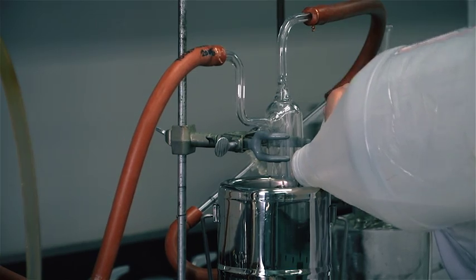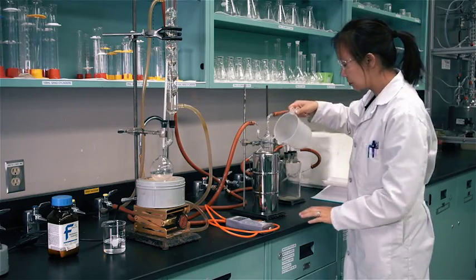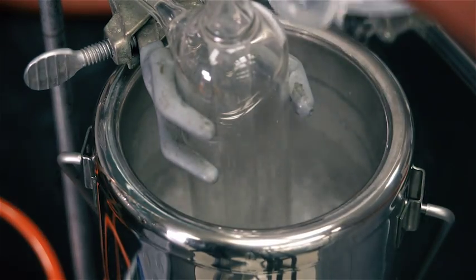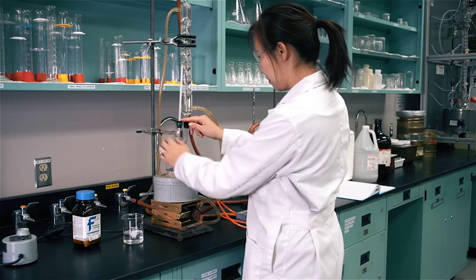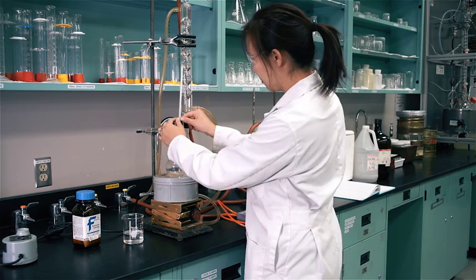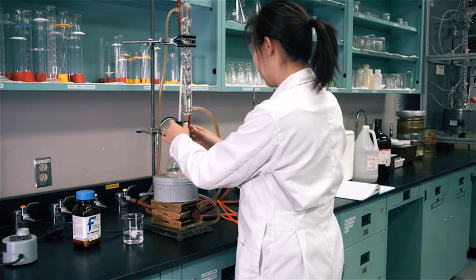Put acetone and dry ice into the Dewar flask. Make sure the thermometer is in the correct position to measure the temperature accurately.